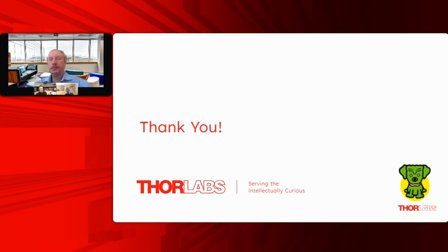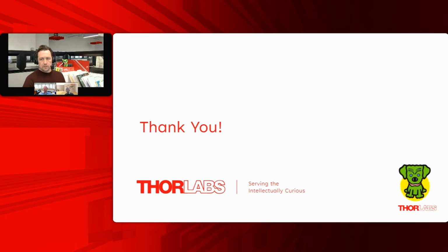Feng, a couple of fundamental laser questions, following on the beam quality. This one is about the differences between ICLs and QCLs. Can you go into a little bit of detail about what those differences are, but importantly, what the trade-offs and limitations are in terms of what's achievable with those two technologies?